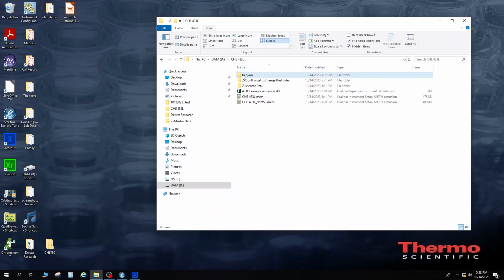To look at your data from a Thermo LC-MS, you're going to want to use a software called Qual Browser, as in qualitative browser. You can see the icon for that software is over here on this desktop. It should be on most of the PCs in the lab. If you own a PC, you can actually put this software on your PC. And we have some loaner laptops in the lab that have this software on there, so you can look at this sort of offline.